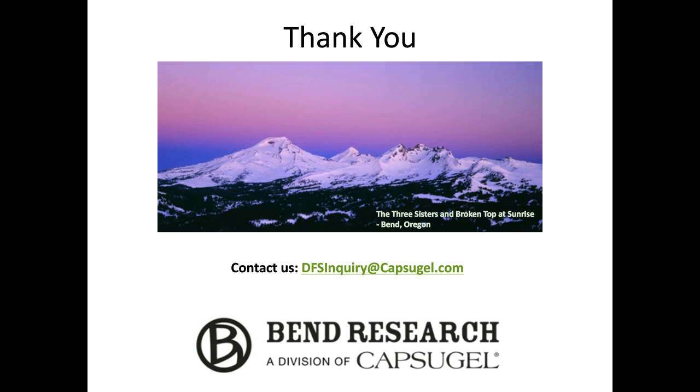The majority of the sample lines are in FEP or other fluoropolymer tubing that is cleaned between each use, so that whole setup through the navigator and all of that can be fixed in place. Part of our routine maintenance program is to replace that, say, annually. We come out and put new tubing in to replace that. But it's kept in place run to run and cleaned between each sample.